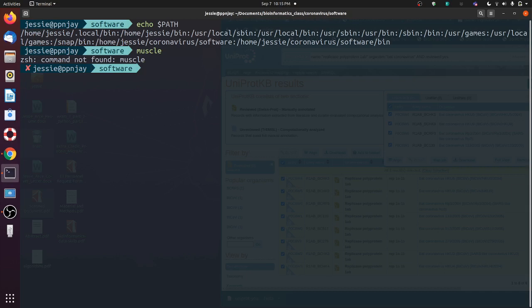Now what I need to do is just recreate it. I'll use export to create a new environment variable, and I'll just call it PATH. So I'll be recreating this variable here, and I will put double quotes and put $PATH here. What this does is just expand, so now it's going to be the same thing. I'm just putting this whole thing into here, which will equal PATH, and nothing new there. It's going to be the same as what it's already set to.